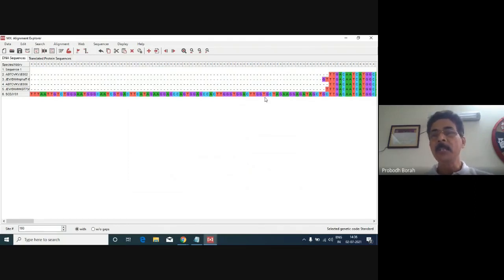So for doing the alignment, we should not use this segment, because unnecessarily and wrongly it will show a lot of disparity or variation with the other sequences, because in the other sequences there is automatic creation of gaps. A gap means a negative score in alignment. Therefore, it will show great dissimilarity with the number 6 sequence. But that is not true, because the sequence segment is not available. That is why there is creation of gaps. So what we will do, we will keep the common part and eliminate the non-common part, the segment which is present only in the 6th.